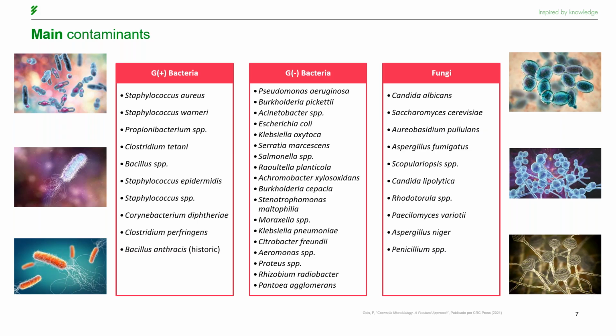Some that we can assume are exclusive pollutants from production because they are attributed to raw materials would be Clostridium, which can be found in talc, for example, which is derived from the soil. And during production, we can find contamination from raw materials, processed water, poorly designed equipment, ineffective cleaning and disinfection processes, of course, poor hygiene of workers and facilities, and lack of training and awareness.